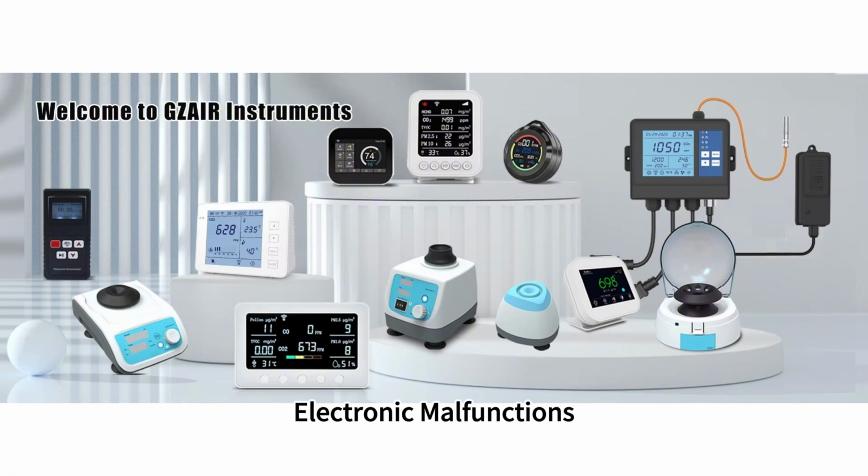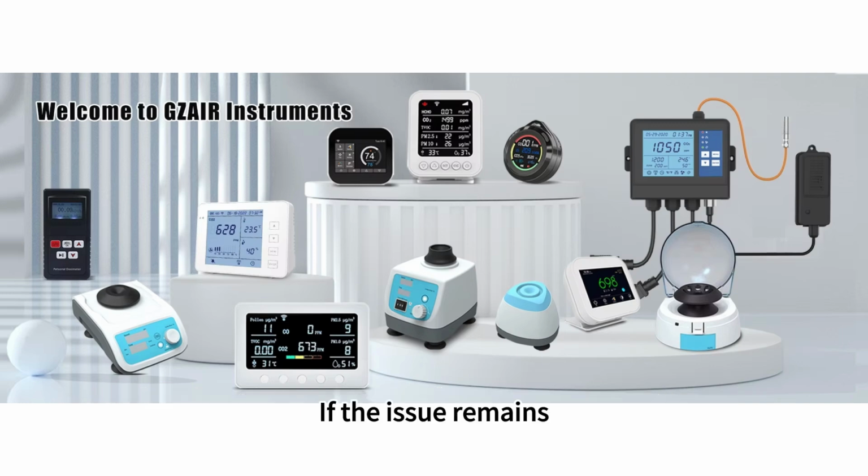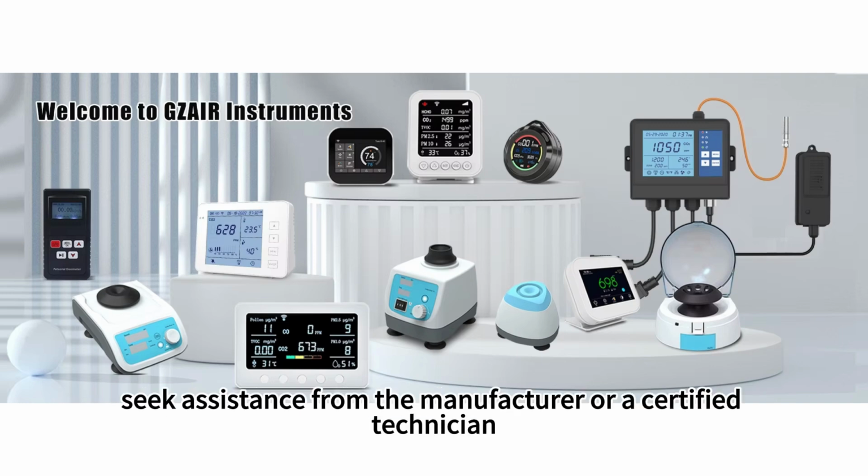5. Electronic malfunctions. Solution: unplug the mixer and wait a few minutes before plugging it back in to reset the electronics. If the issue remains, seek assistance from the manufacturer or a certified technician.